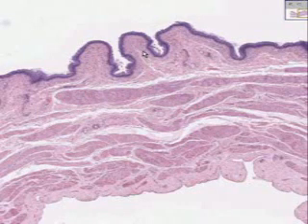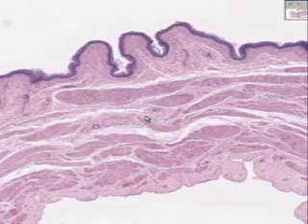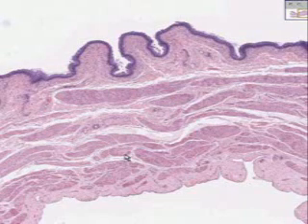And then notice the majority of the thickness of the bladder is smooth muscle bundles arranged in whichever way they have to be arranged to do their job of detrusing or squeezing out the urine, which is why it's also called the detrusor muscle. Notice then we have some connective tissue out here, and notice that the top part of the bladder, or the superior part, is covered by serosa. So you may very likely find some mesothelial cells along here, which you do. I can see some already.